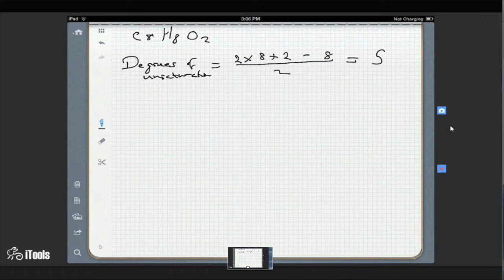Oh, there's probably also a benzene ring because there's some consistency. Wait, wait, wait. NMR at 10. Oh yeah, there's an aldehyde, and there's also a benzene ring. The NMR is like just the 2 peaks of it.